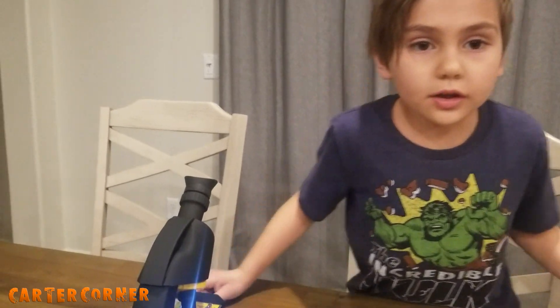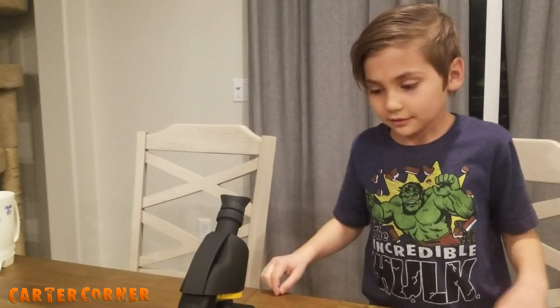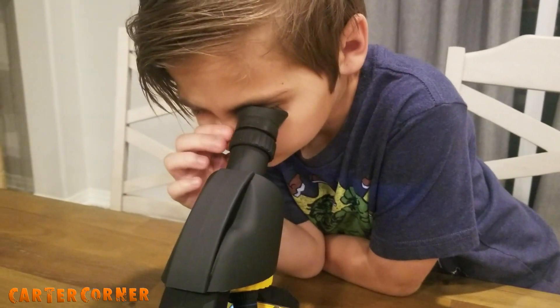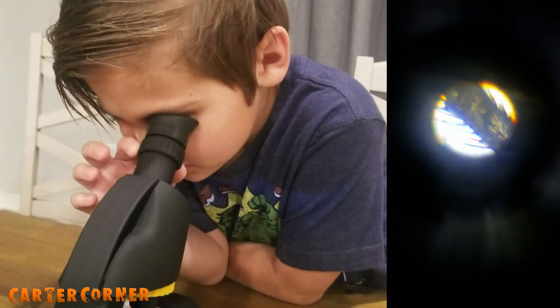The last thing we're going to look at is a cricket leg from Barbossa's Crickets — this freeze-dried cricket food. Oh my gosh, it looks like a cactus. It has all kinds of little tiny hairs on it.